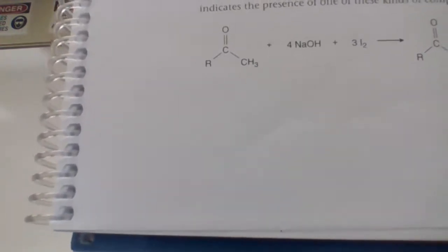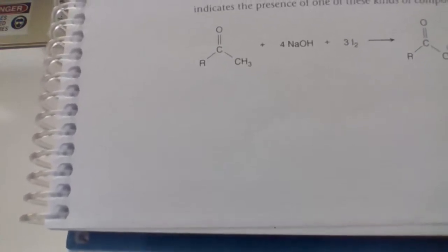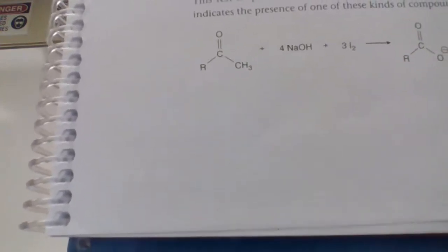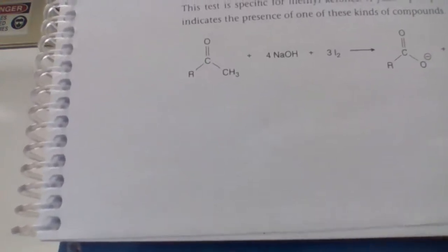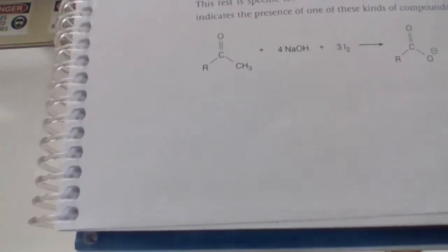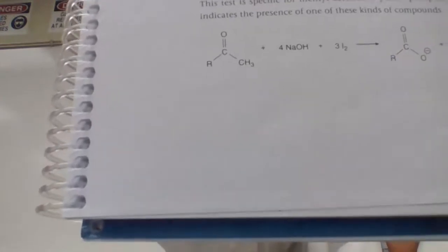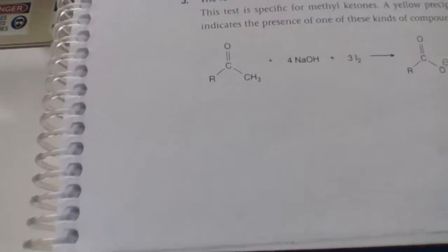as a yellow precipitate. And with the yellow precipitate forming, that means that if your compound was not aldehyde and it was ketone, and now your ketone gives a positive test with iodoform, that means your ketone is a methyl ketone. So if your ketone is proven to be a methyl ketone, you are one step closer to giving a structure formula for your compound.